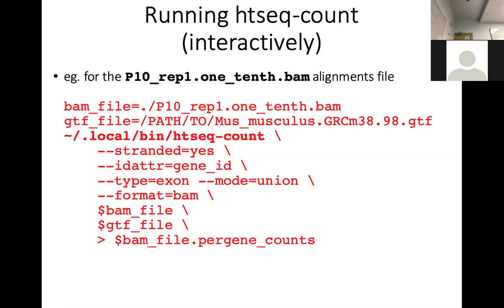So previously I ran the alignment. What does it say? Oh, well, it's ./.gz.gz. It's thinking this is a file name. Okay, and so it's looking for that file. I see. Does it mean it actually ran or not really? No, it isn't. And it should exist, but STAR is not.